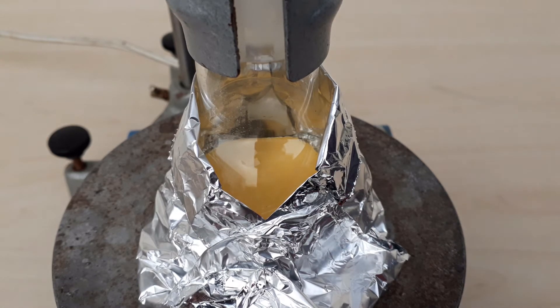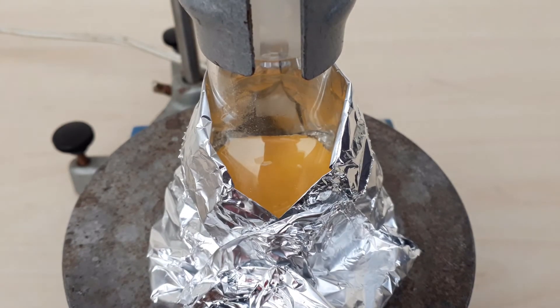I then let this sit outside for some 3 hours. You can see the material gradually obtains an orange colour, and this is important — I'll get back to this later.